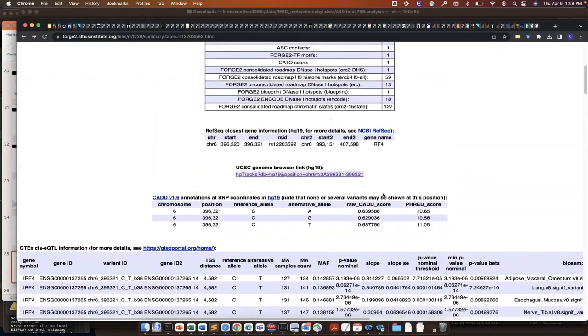This is why the cell type specific context is so important. And spoiler alert, we're developing a version of this method where you can select the cell line that you want, and we'll give you all the data. Currently it's static.